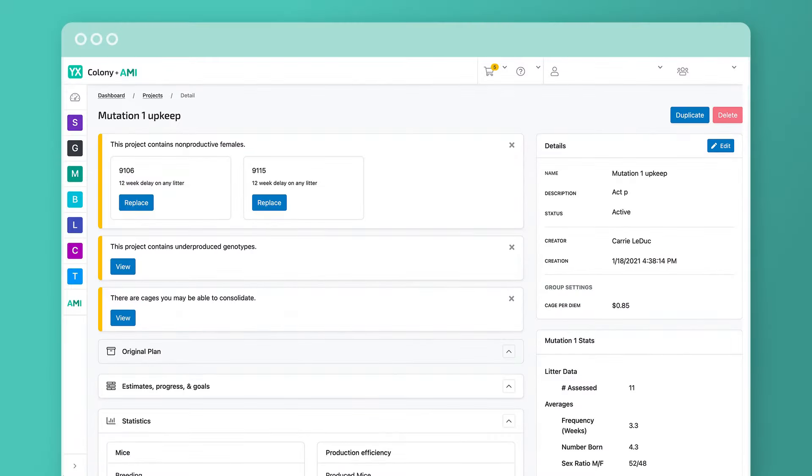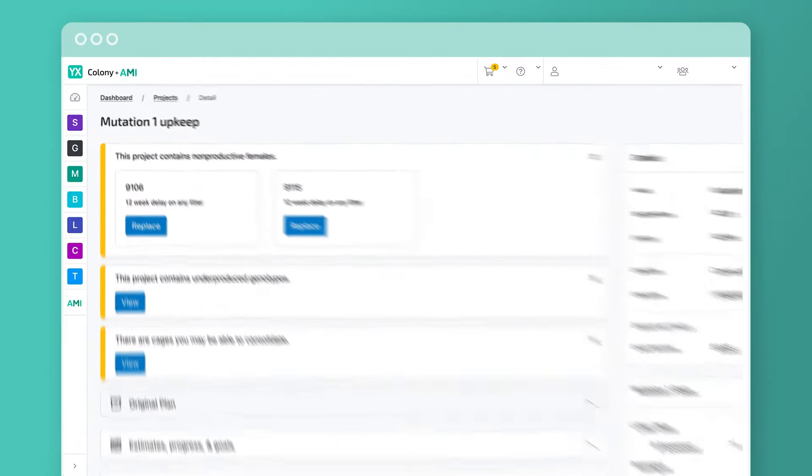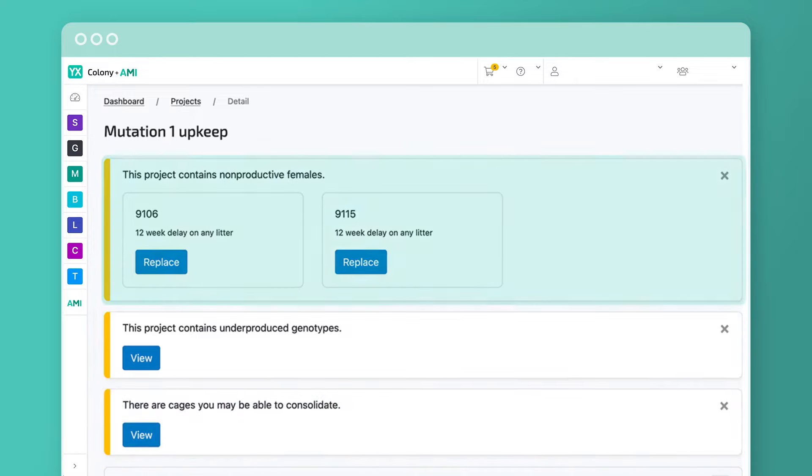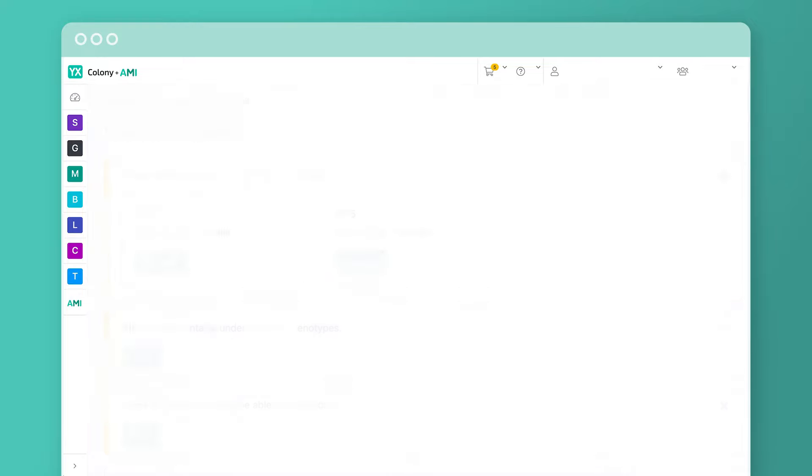When you're viewing a project, I'll provide warnings if there are opportunities to reduce cages, replace non-productive breeders, investigate non-Mendelian results, or prevent pup loss.